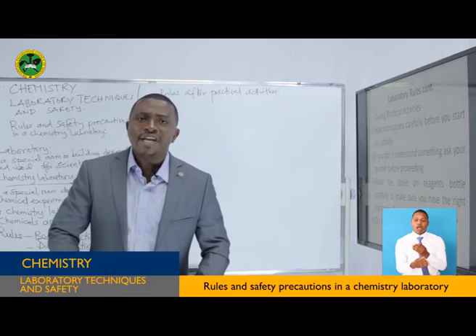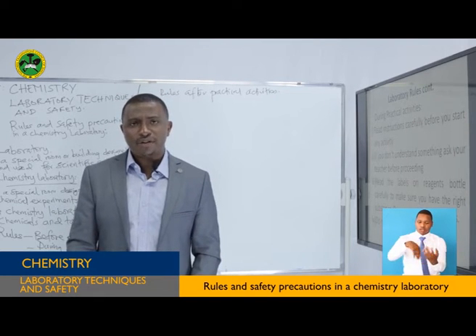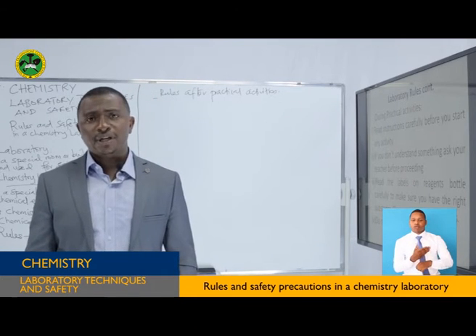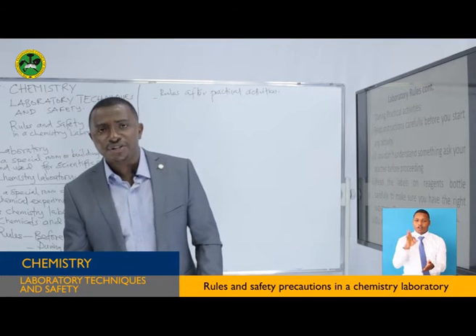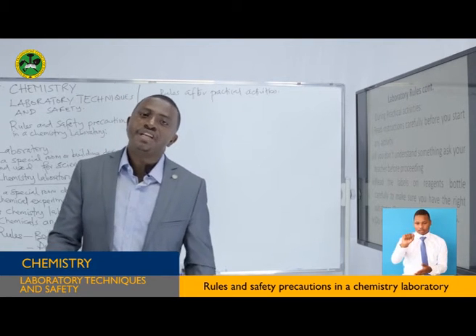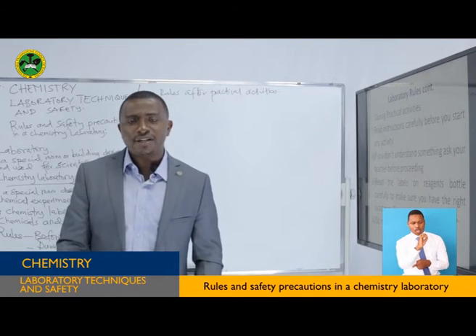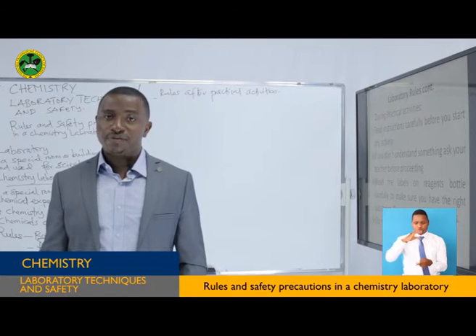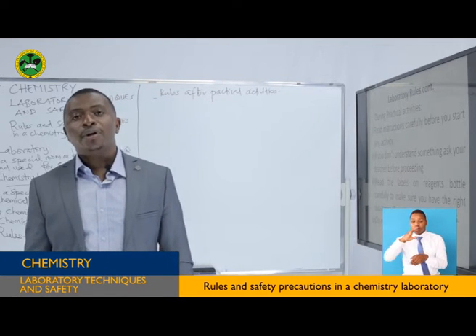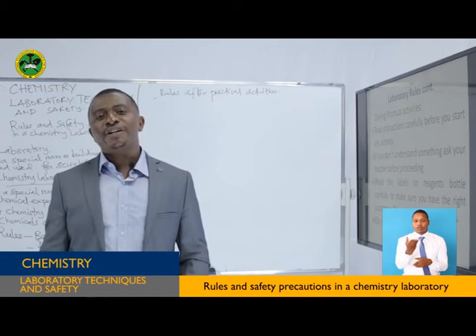There are also gases produced, so you never know. You better not drink when you are in the laboratory, and sometimes you can mix up and drink some chemicals. Take an example of Fanta orange and a methyl orange indicator. You can think that you are drinking your Fanta and find yourself drinking methyl orange indicator, which is very harmful. It's a chemical. Therefore, don't eat anything that you find in the laboratory.